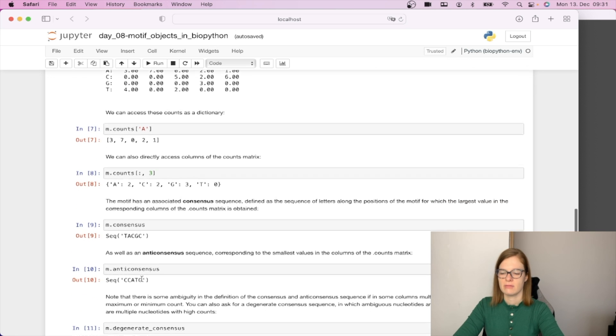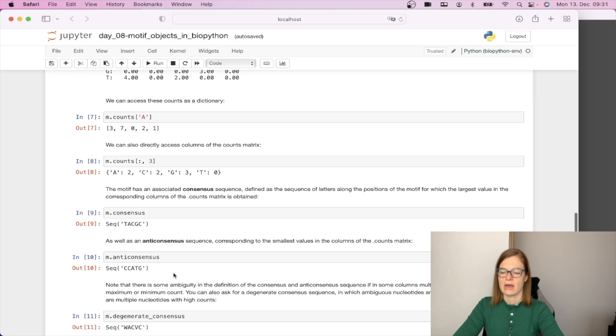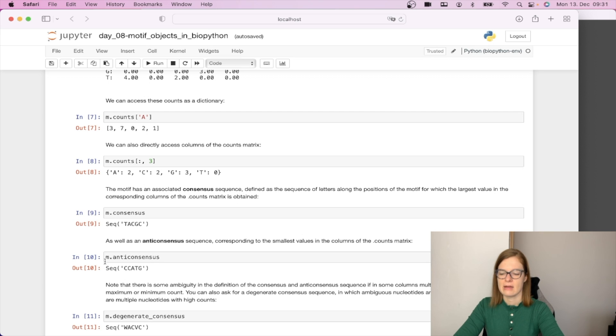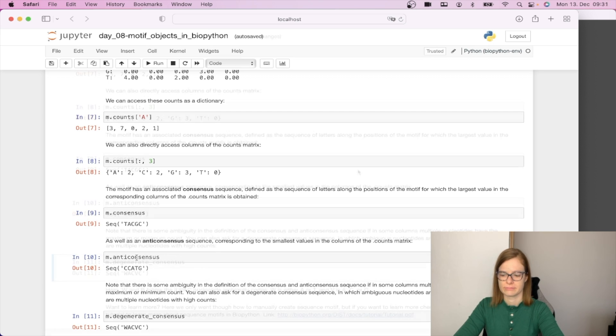Similarly we have the anti-consensus sequence which corresponds to the smallest value in the columns of the counts matrix and we can print it by saying m.anticonsensus.